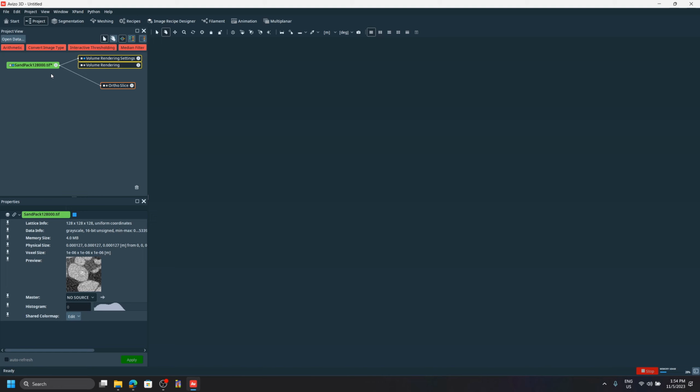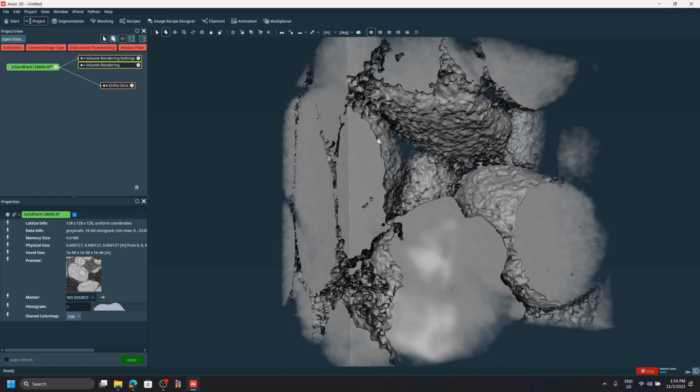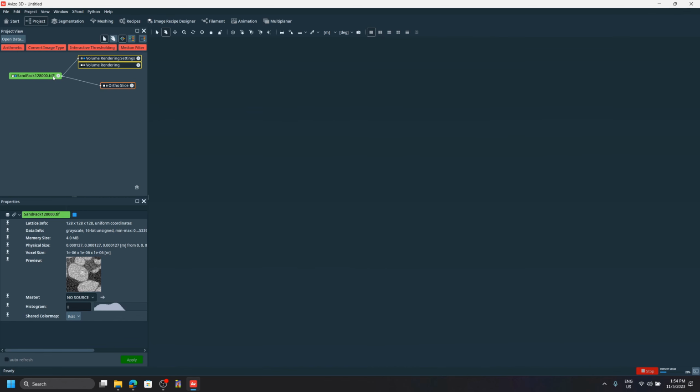Because segmentation data is not really binary, but you can think of each voxel as an opaque material. Let me show it, okay? Yeah, exactly. I didn't want to say binary because once you have more than one material, it's not binary anymore. And that's what we're going to have for the beginning, right? So let me just go ahead and do that.